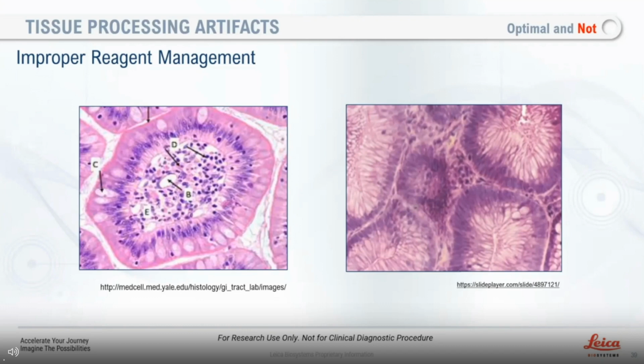Usually they're using an artery and a vein to move fluid in and out. It perfuses, right? It's accessing and maintaining the whole organ without dissecting it yet. I think it's common in brain, large organs, lung, like that. Yeah. All right.